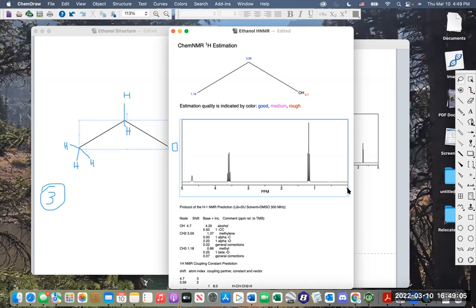The location of an NMR signal indicates where a particular proton or group of chemically equivalent protons absorbs based on its chemical environment. Changes in locations of signals are known as chemical shifts. Chemical shifts are influenced by electron density, the electronegativities of neighboring functional groups, and diamagnetic anisotropy, although this particular factor is specific to aromatic protons.